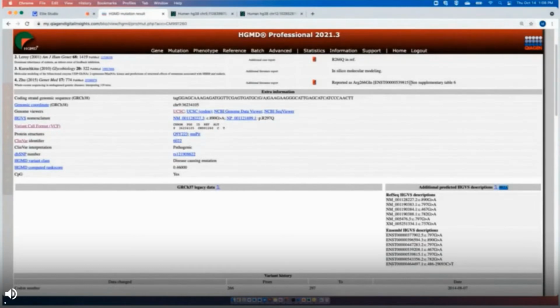And so you can match it up, that 815, and from here it gives the cDNA so you can confirm that the 797 G to A is actually this 266Q if you translate it to amino acid.